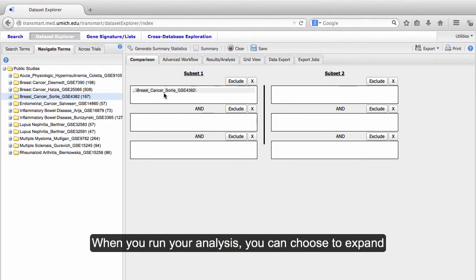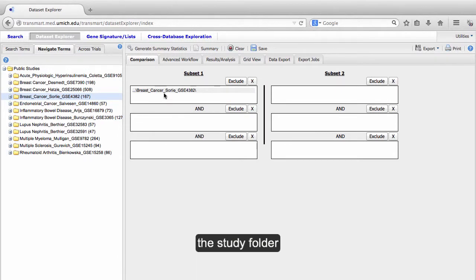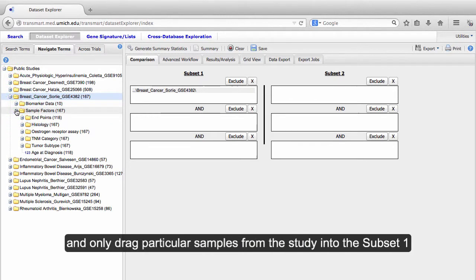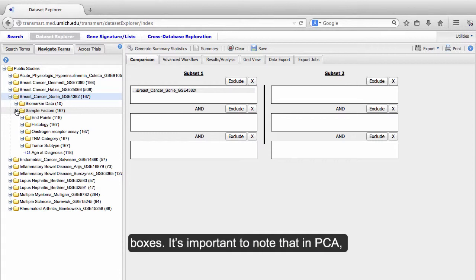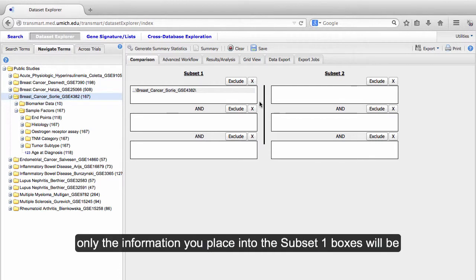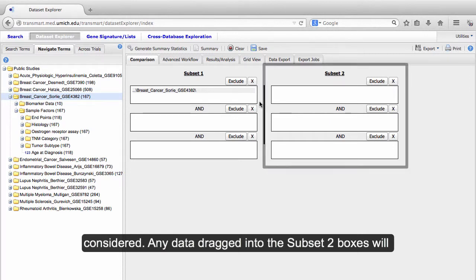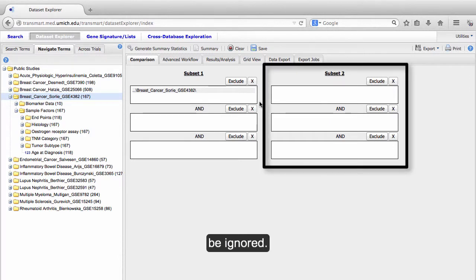When you run your analysis, you can choose to expand the study folder and only drag particular samples from the study into the Subset 1 boxes. It's important to note that in PCA, only the information you place into the Subset 1 boxes will be considered. Any data dragged into the Subset 2 boxes will be ignored.